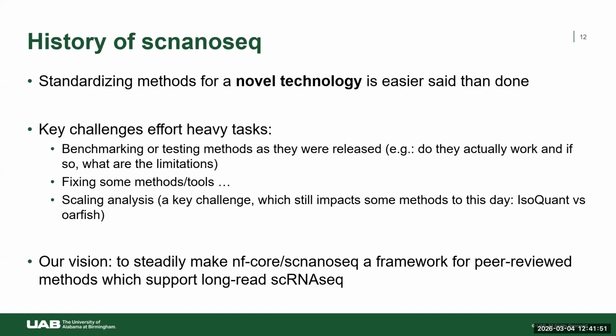And one last thing about this idea. Why did we want to add Blaze? Why did we want to add these peer review methods? In my view, a big reason was because we wanted to provide users flexibility in their analysis, because Nextflow is very modular. If you have a process in Nextflow that uses any sort of command line based tool, you can access any of its parameters, even if we've not exposed that for you directly.